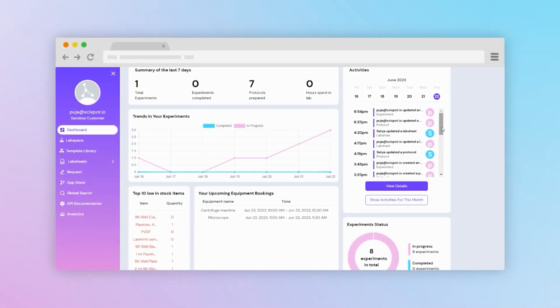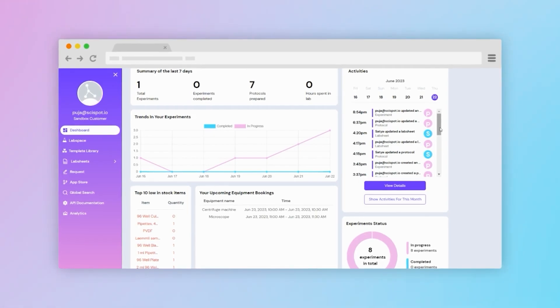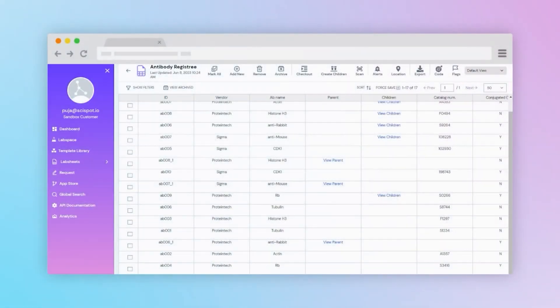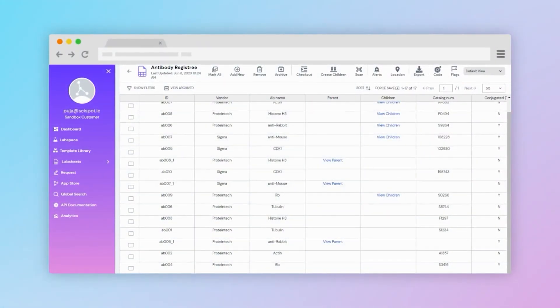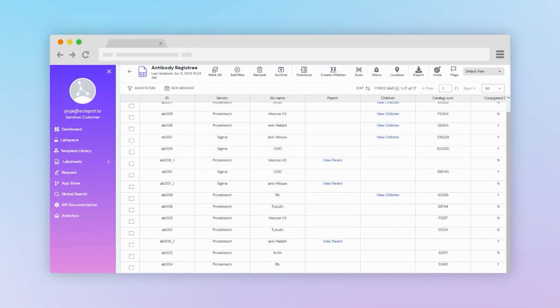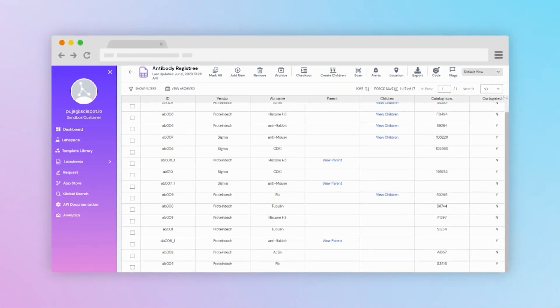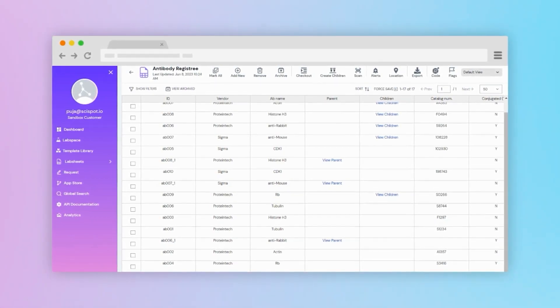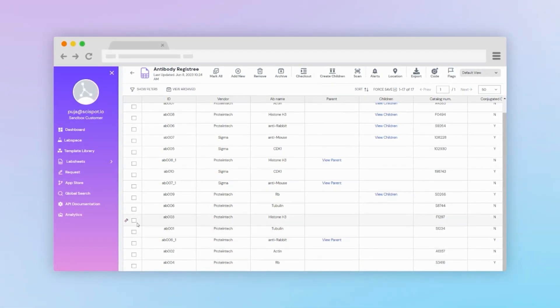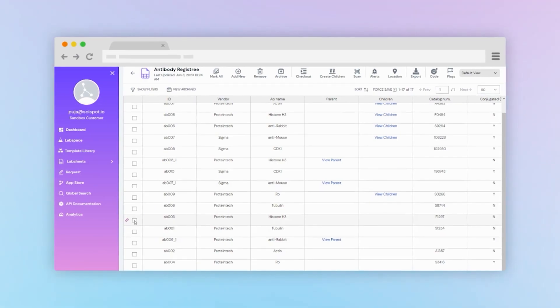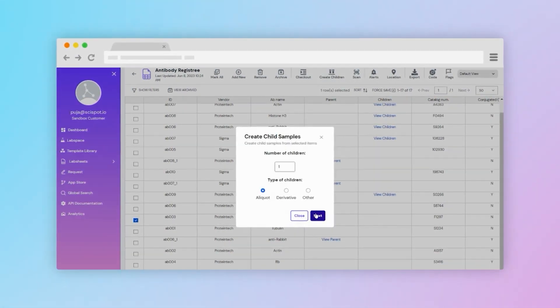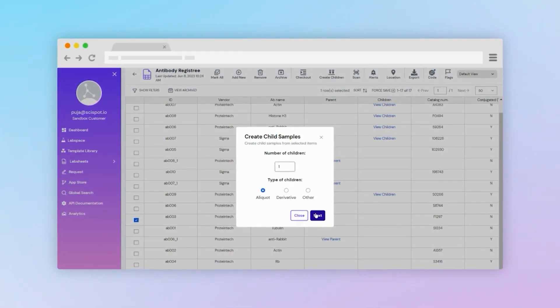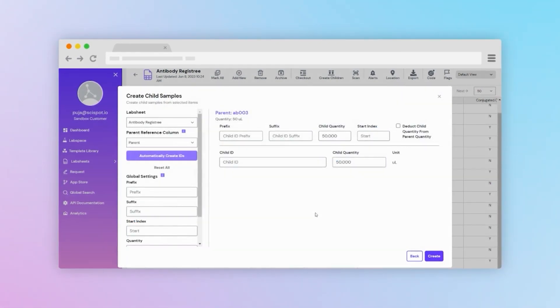SciSpot is not limited to inventory management alone. It also provides the ability to store metadata for various elements such as antibodies, animal studies, and more. For example, if we check antibody registry, you can easily create a parent-child tree structure for your starting stock and working solution.